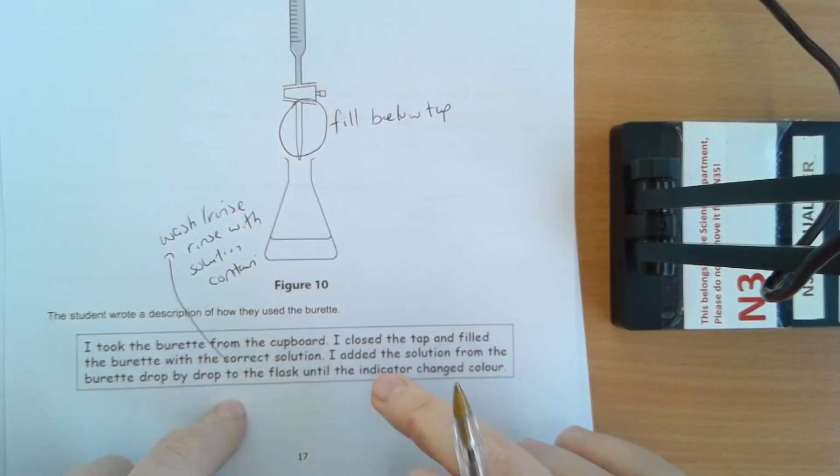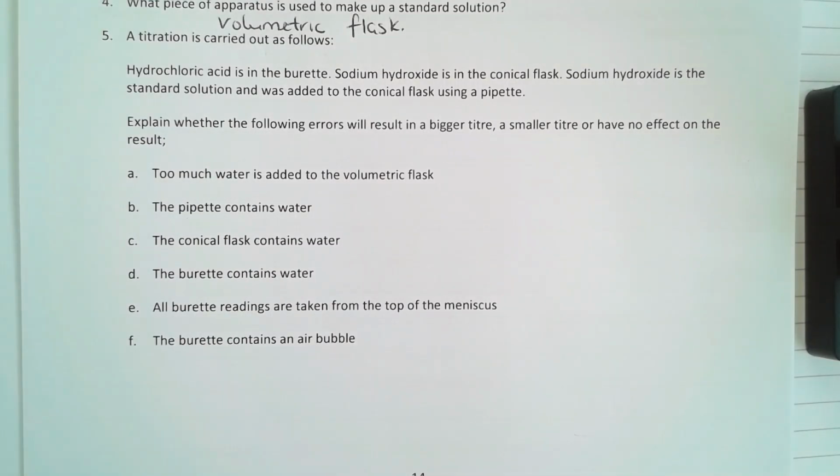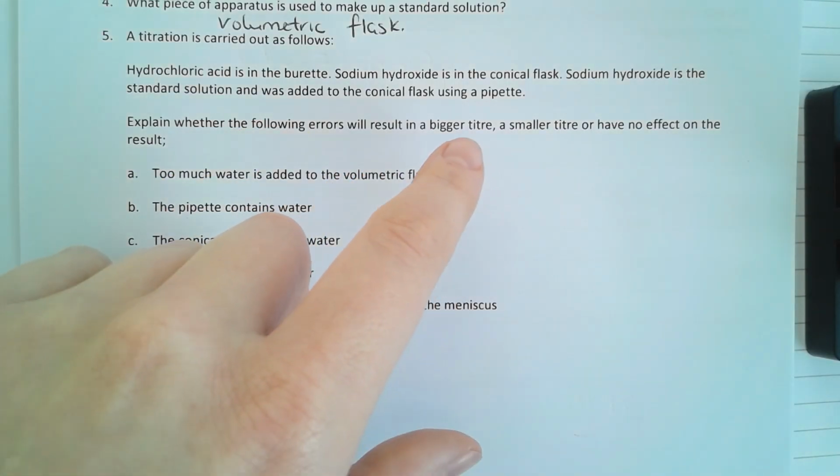Alright, there's a few other things accepted. You'll see that on the mark scheme. Most of the other exam questions are just about the colour of the indicator and about things that you can do to make it more accurate. But recently, the last 2 years in particular, they've started asking questions like these, about errors that students make and how it affects the titer.